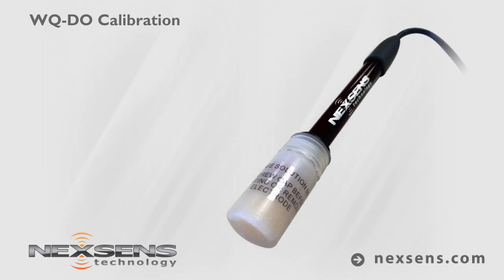When not in use, store the WQ DO sensor in the storage bottle with a wet sponge. A storage bottle is included for convenience. NexSense WQ Sensors — the latest in smart sensor technology.